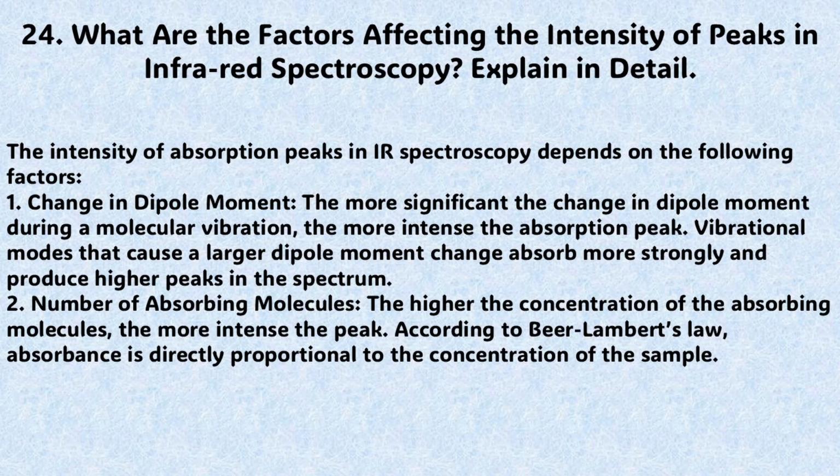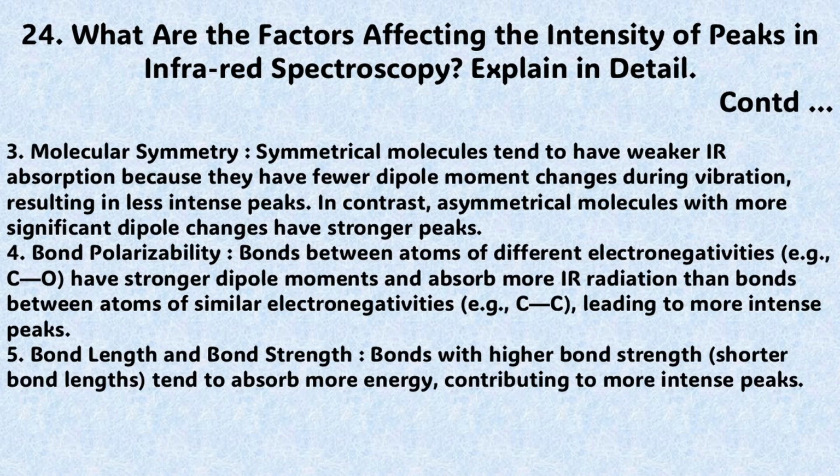Change in dipole moment: the more significant the change in dipole moment during a molecular vibration, the more intense the absorption peak. Vibrational modes that cause a larger dipole moment change absorb more strongly and produce higher peaks in the spectrum. Number of absorbing molecules: the higher the concentration of the absorbing molecules, the more intense the peak. According to Beer-Lambert's law, absorbance is directly proportional to the concentration of the sample.